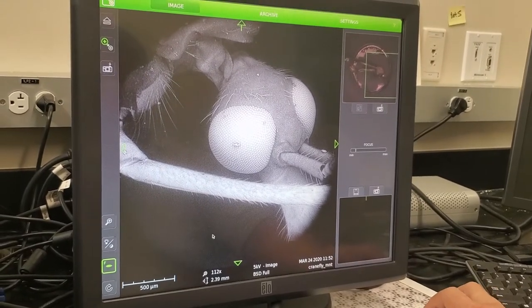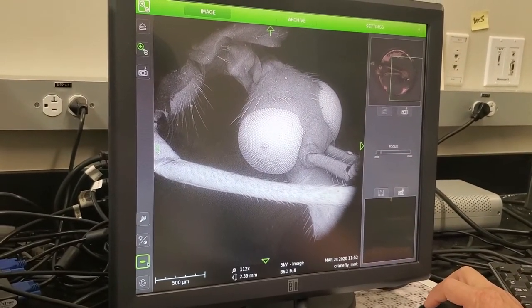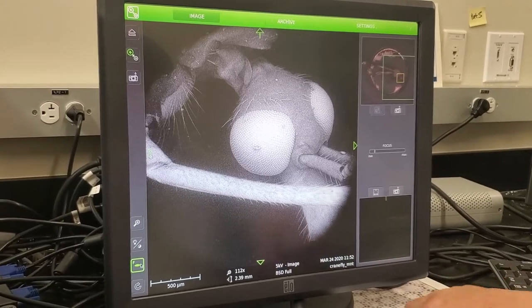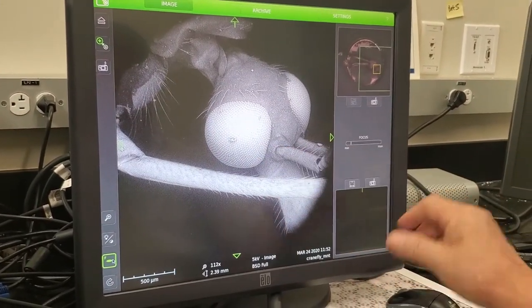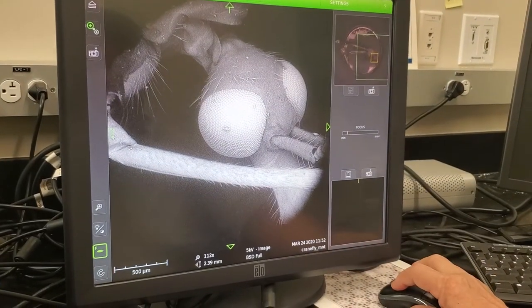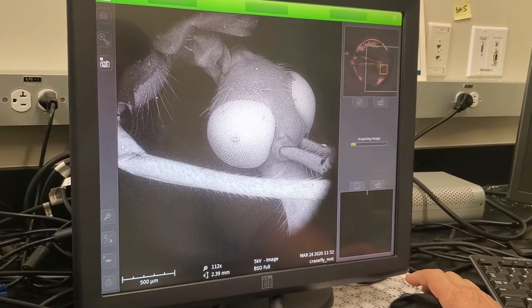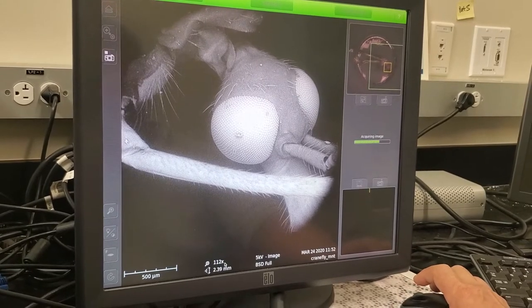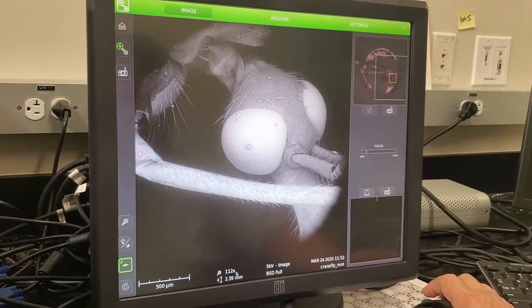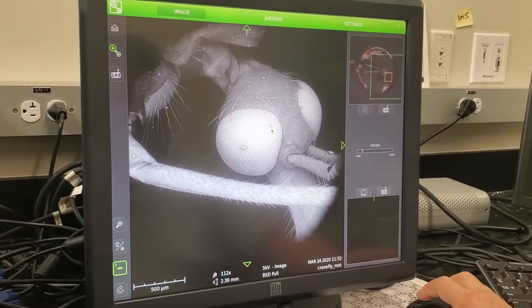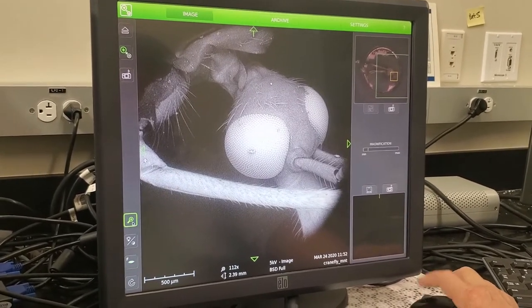So let's go ahead — I'm going to find focus just a little bit. Make sure it's best focused. Concentrate on one of the lines and make sure it's the finest. Now take a picture. That's a weird magnification — normally you don't want to do that. But that's the lowest it can get. So let's point at this thing and zoom in.